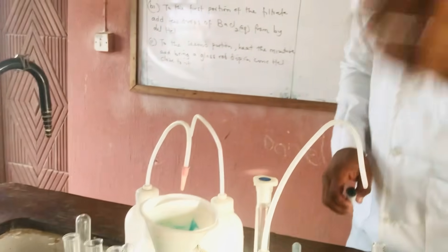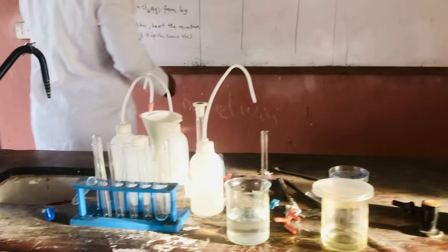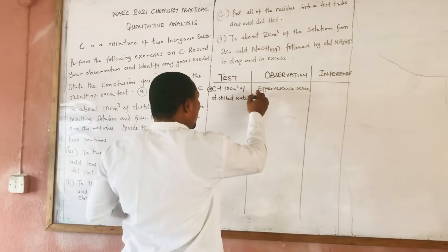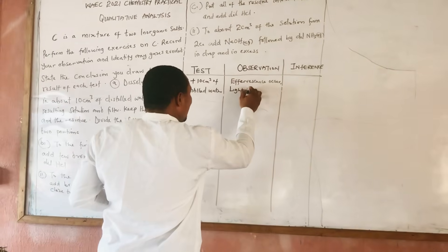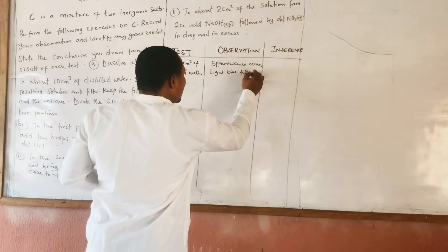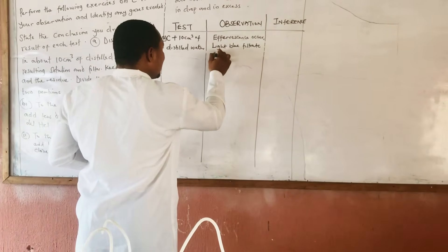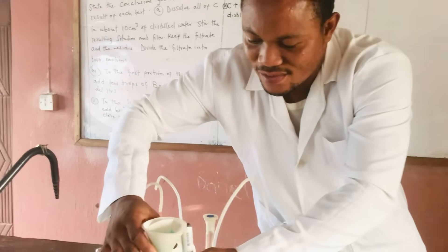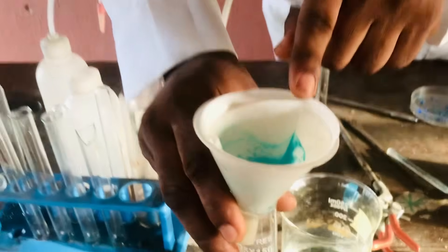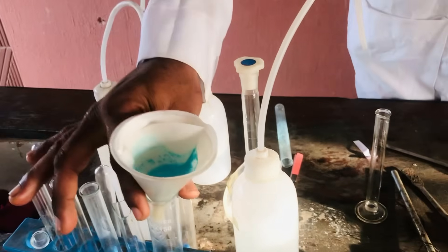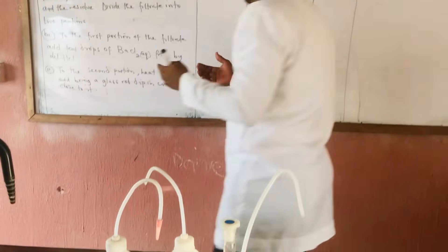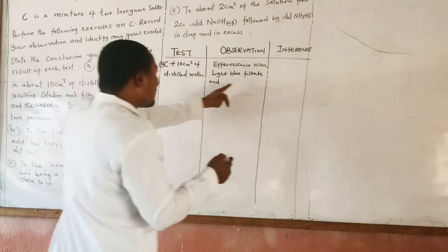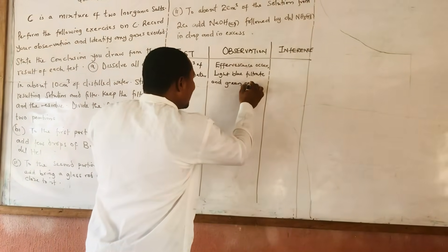Let's record that first. Keep the filtrate and the residue. Divide the filtrate into two portions. We have a light blue filtrate and — let's see the residue — that's a green residue. Some people say bluish green, but I'm calling it green so we don't confuse ourselves.